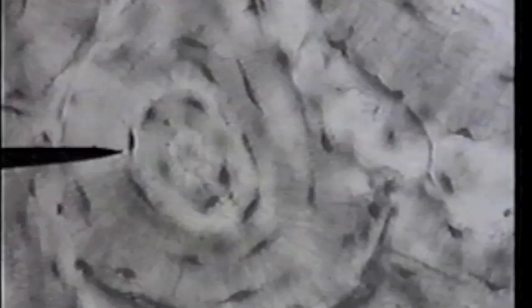When you look at this slide, you can see that the osteocytes have been laid down in concentric rings, in layers. Those concentric rings form what is called the osteon. The osteon is the basic unit of compact bone.